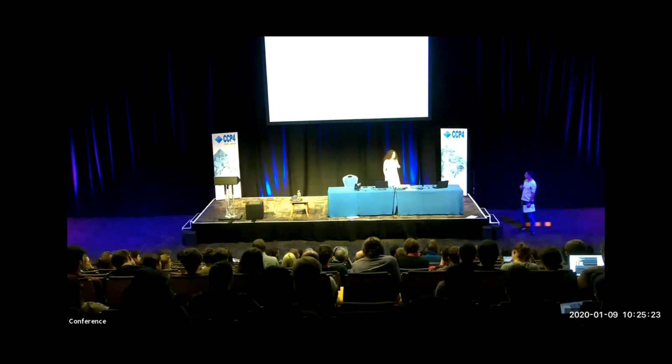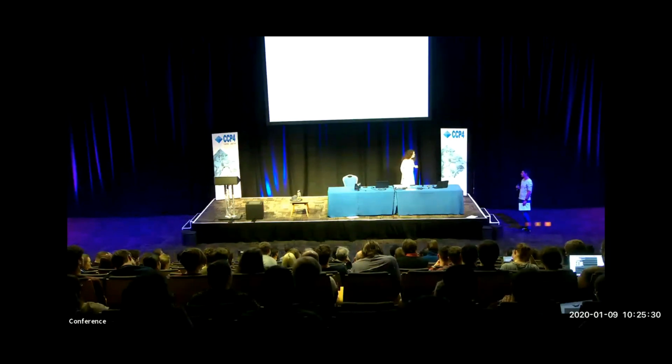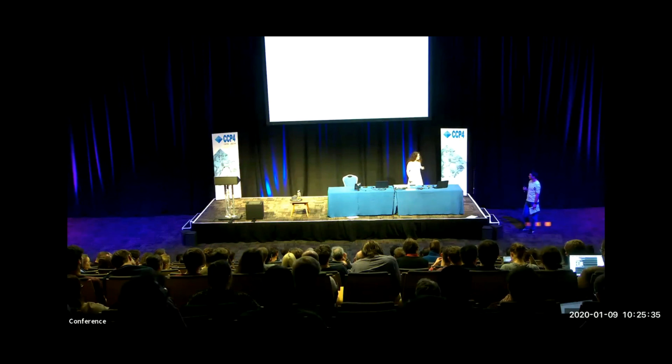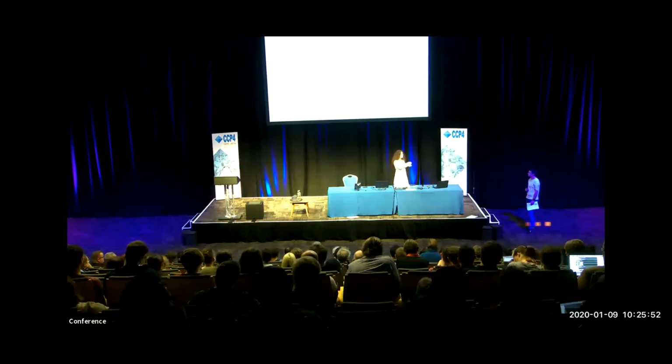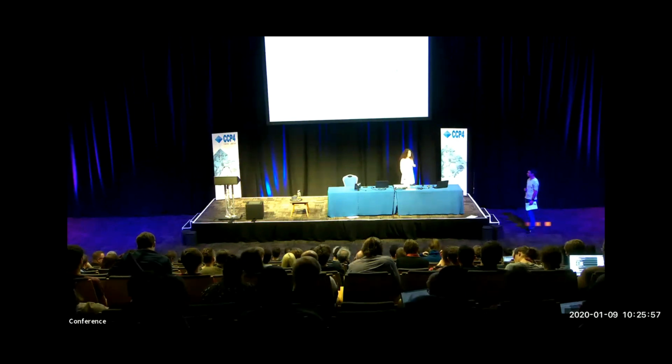So just one thing I noticed looking at your ensemble bundles: how do you decide the global scaling that you apply? It looked, from a quick view, that if you had an underlying B factor, that could shrink your bouquet of ensembles, and that might also help minimize the number of parameters you're trying to fit. Yes, I agree, so I have the option to include a global B factor. Generally, I haven't seen this improve any structures.